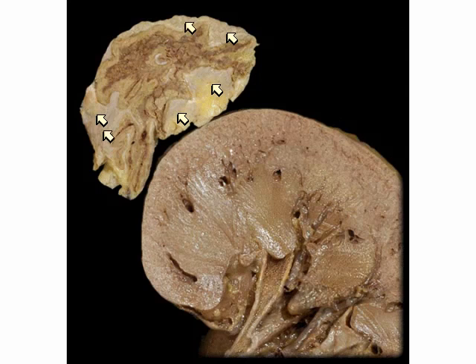But the adrenal gland itself has two distinct areas. This little outer rim of it, do you see right here? All right, this area is called the adrenal cortex. So it forms, you can see it all the way around it. And then the inner part right here is the adrenal medulla. Okay, so actually the medulla, let me redo that. The medulla is just this very central part right here. The cortex has some distinct regions. So right there, all of that would be cortex.